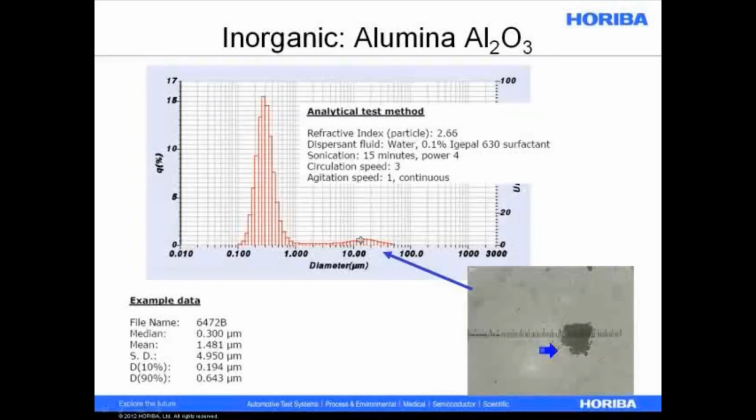But really, laser diffraction won't really tell you whether these are large particles or aggregates. That's usually when a microscope in your lab comes in very handy, or an image analyzer like the PSA 300, where the image can actually give you a feel for aggregates versus just a few large particles.